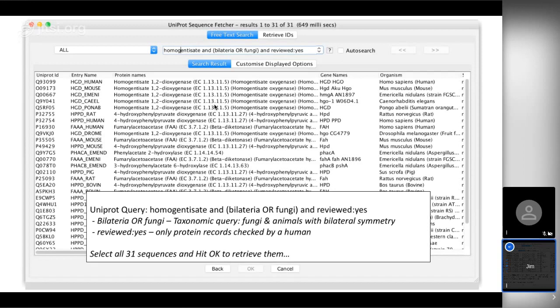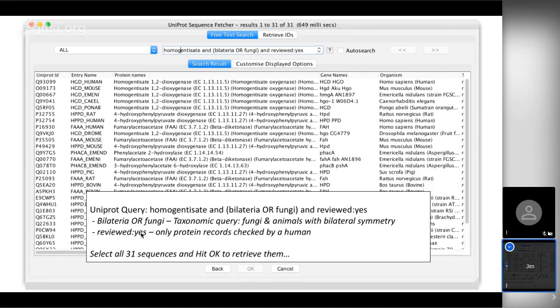I also included fungi, because fungi are one of the most simple eukaryotes which have many of the genes that we have. I've added another term: reviewed colon yes, which limits the set of records returned to just those proteins that have been looked at by a human — so you know the annotation is real. Without that, you'll get a lot more gene sequences and proteins, some of which may not exist, or if they do exist may have been annotated electronically as a prediction rather than observed by someone who confirmed the domain and active sites are in the right place. So I get 31 sequences, selected them all, and hit OK to retrieve them.